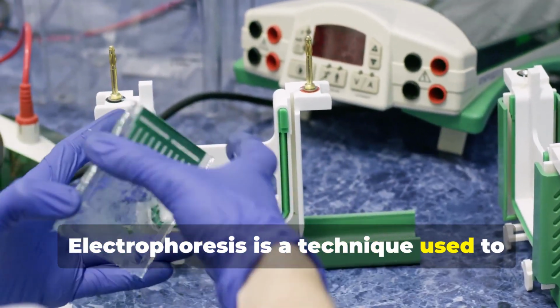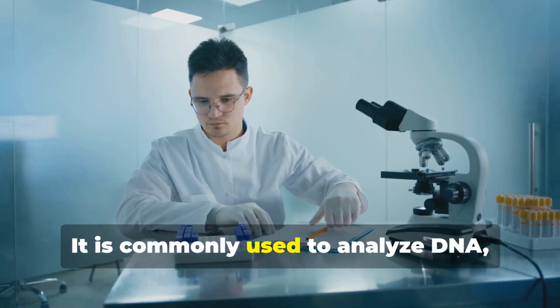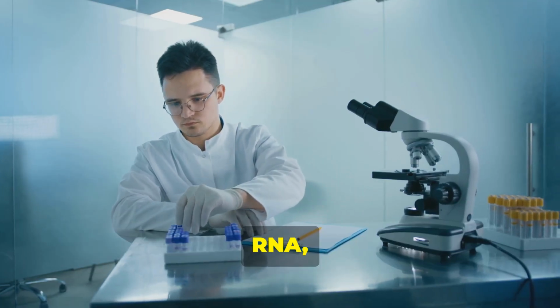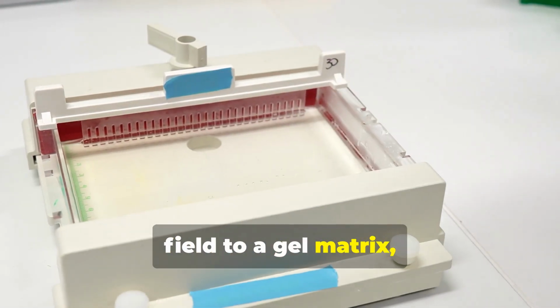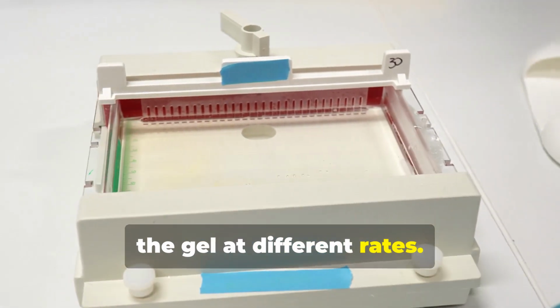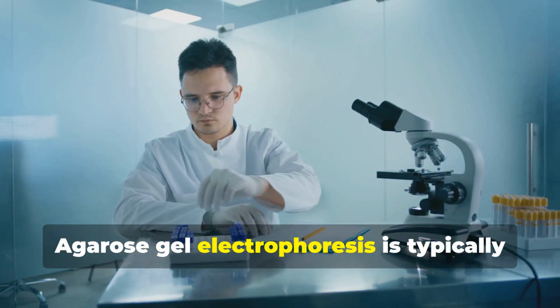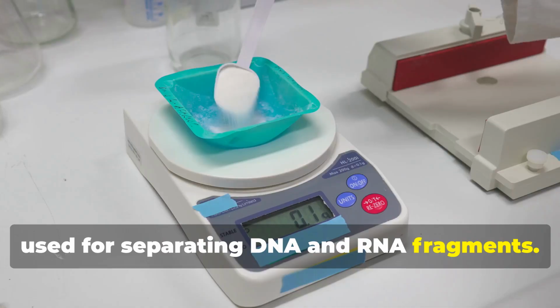Electrophoresis is a technique used to separate molecules based on their size and charge. It is commonly used to analyze DNA, RNA, and proteins. The process involves applying an electric field to a gel matrix, causing the molecules to migrate through the gel at different rates. Agarose gel electrophoresis is typically used for separating DNA and RNA fragments.